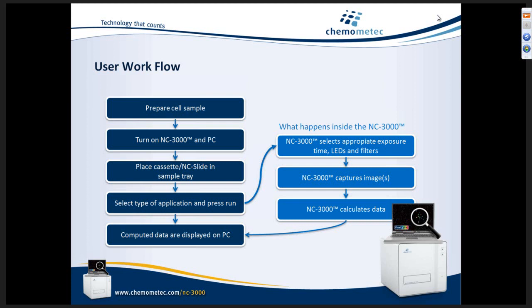No big data fiddling around, it's pure science you have the time for. So no calibration, no compensation, no cleaning, whatever. It's just put in the sample, press the run button, and get your results out immediately.